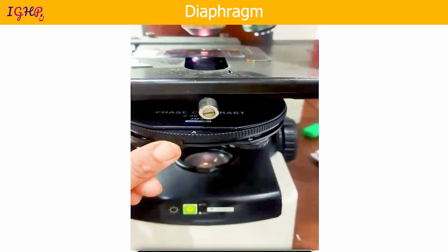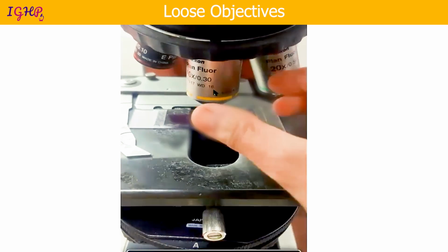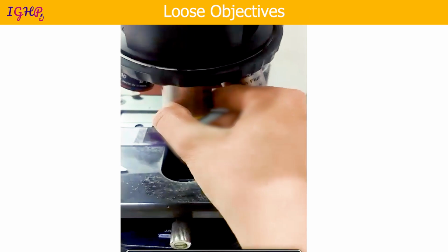Now once you know the architecture, that it is nodular or it is follicular, you can completely open the diaphragm and look at the cellular details. Sometimes when you start doing your slide microscopy, your objectives will be a little loose. So make sure that your objectives are in place before you start your microscopy.